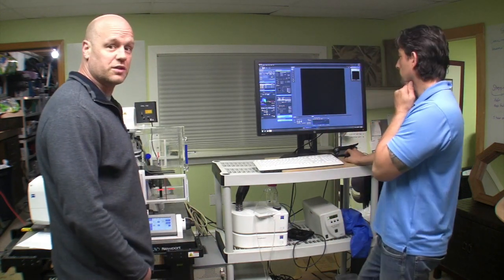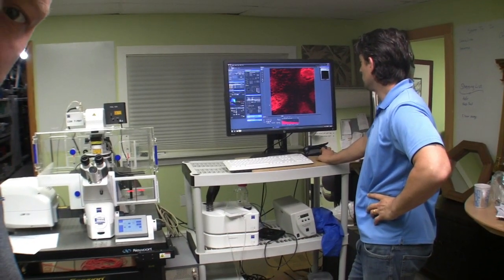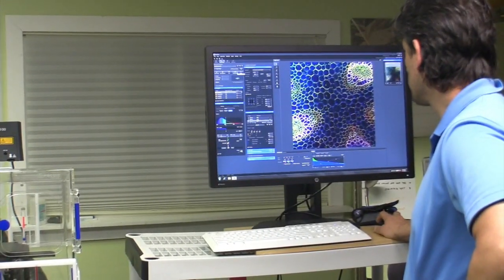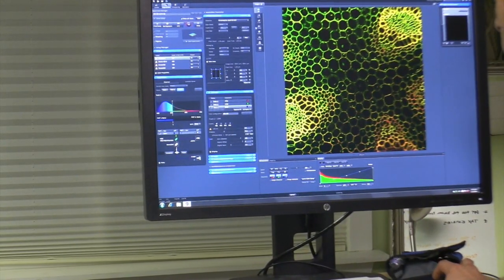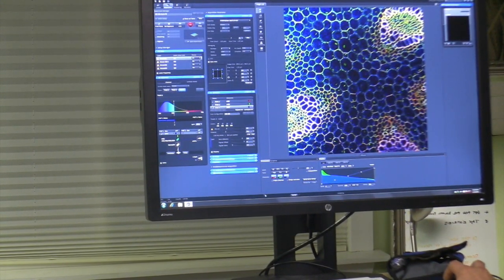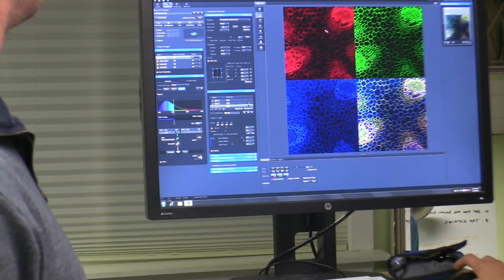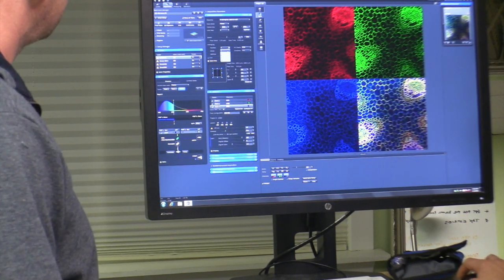That's perfect. We can see right over your shoulder too. Just going to zoom in here on the screen. There we go. So that's three channels right there. So red, blue, and green. You can still see red, blue, and green. And you can actually go here. So this is a split screen. This is each channel individually, and then the combination. Sweet. So we can do that and just make it look nice.